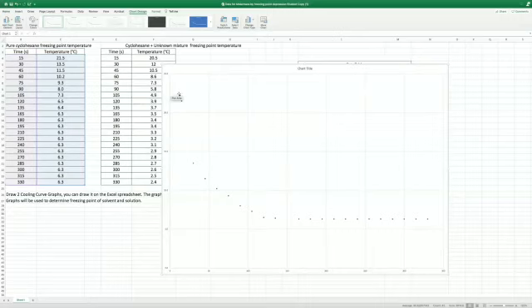And the freezing point temperature, the way you're supposed to figure this out, you draw a straight line from the beginning point. So the straight line will go through the first few points, like right here. So the part where I'm struggling is how to separate the beginning points from the final points.